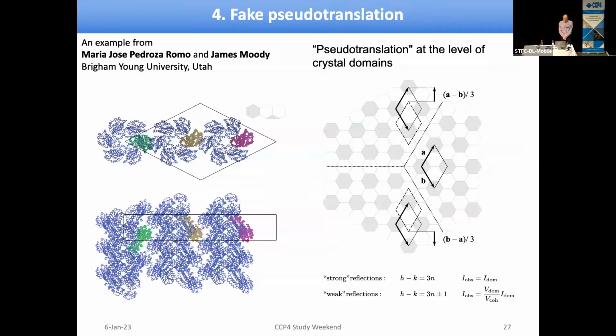Example 4 is quite different. Crystal is composed of helices. 2/3 of them sit on the crystallographic 3-2 axis, and 1/3 on the 6-5 axis. Those on 6-5 are flipped. Therefore, there is a non-crystallographic symmetry, translational non-crystallographic symmetry, but there is no translational pseudosymmetry. The structure cannot be approximately represented in the 3 times smaller cell. Here again, we have packing ambiguity, ordered domains, and defects.